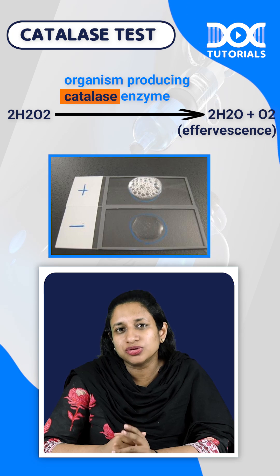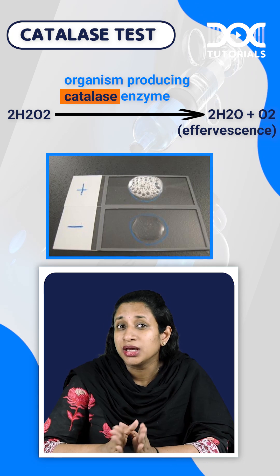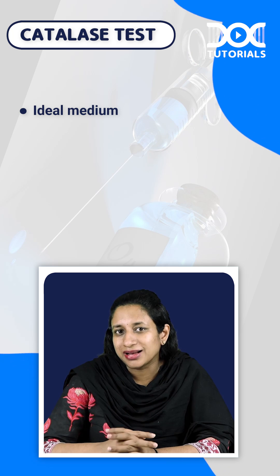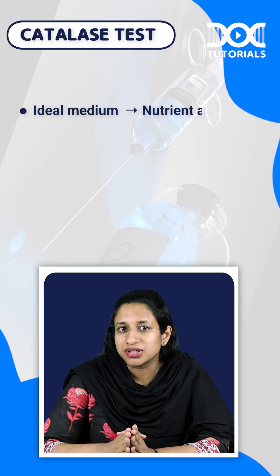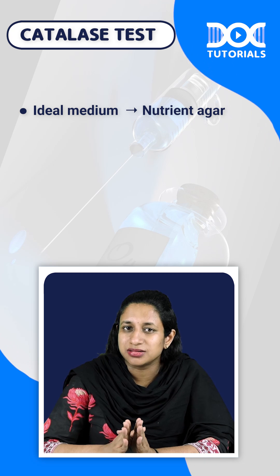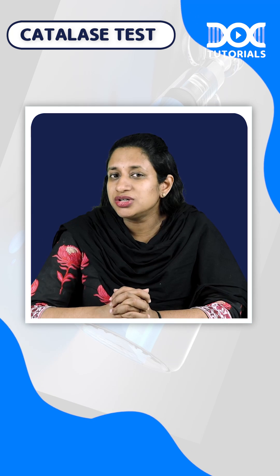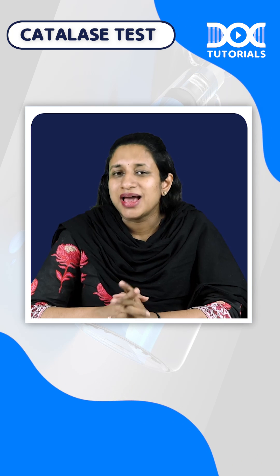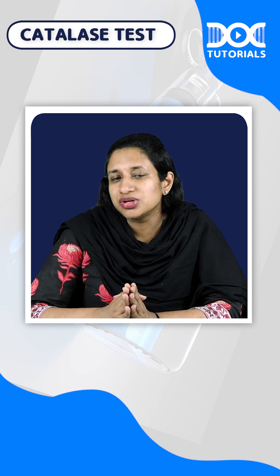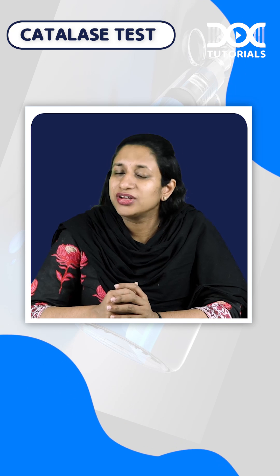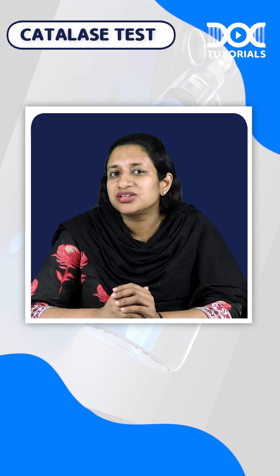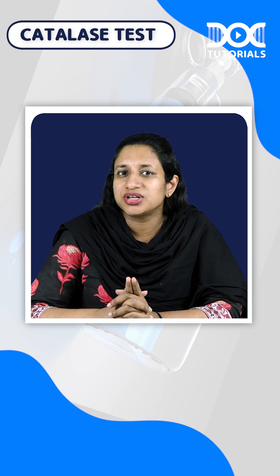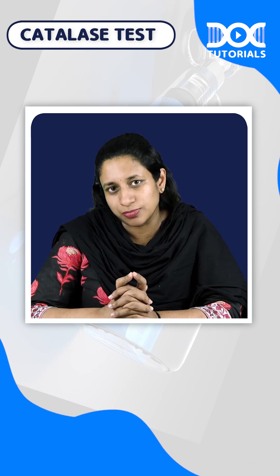There are two important things to keep in mind when doing the catalase test. The ideal medium to be used is nutrient agar, so you are always supposed to test the colony taken from nutrient agar. You do not use a colony picked up from blood agar because it can give a false positive result, and you cannot use your loop to pick up the colony when testing for catalase. Most importantly, the test is done to differentiate between staphylococci and streptococci.